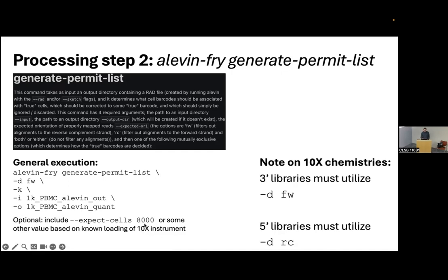So I wouldn't just totally guess at a number there. It should be somewhat based on known values. I don't know that you really can do a ton of harm by specifying a fairly large number like 10,000 or something, as long as you're doing extensive quality control and cell filtering and all of that later.